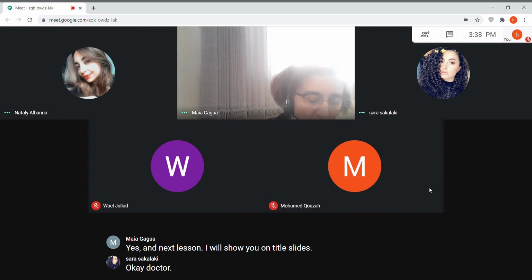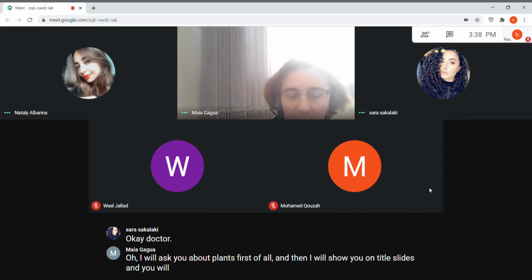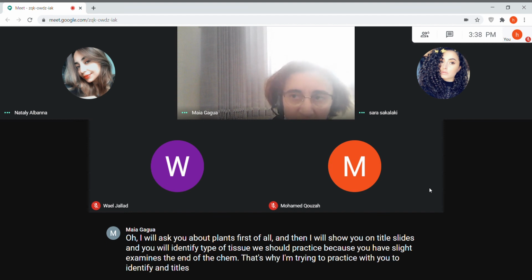I will ask you about glands first of all, and then I will show you on slides, and you will identify the type of tissue. We should practice because you have a slide exam at the end of the term. That's why I'm trying to practice with you to identify on slides during the lesson.